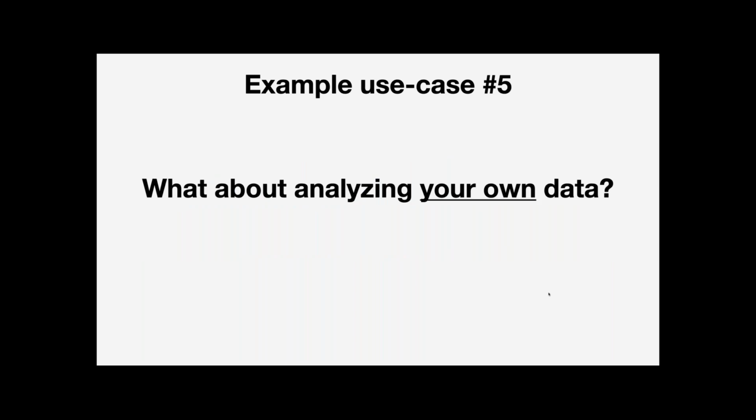So that leads us to our final example, which is what about analyzing your own data, right? We have over 22,000 samples on the database, but there's a good chance we don't have the data set you're most interested in. So how would you analyze other data not represented on the site? And with that, I'll turn it over.